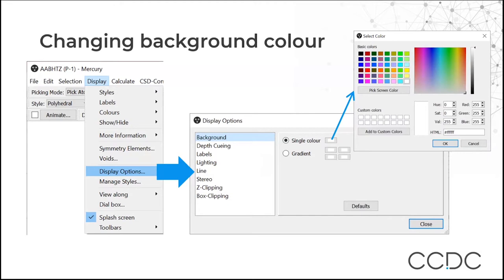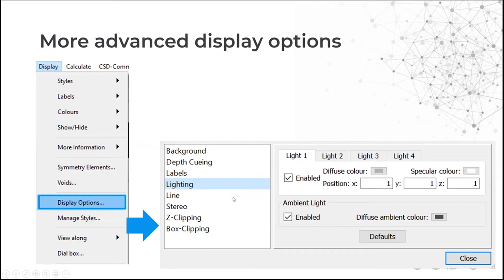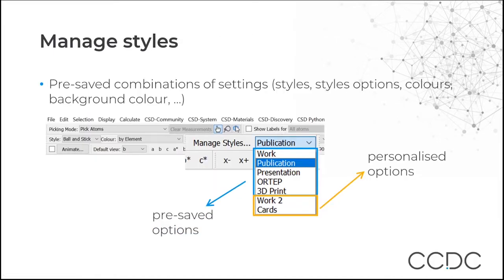As well as changing atom and element colors, you can change background colors. Go to Display and Display Options for various settings including background — you can choose a solid background color or different gradient types. Another interesting option is Lighting, where you can change where the lighting comes from. If you have a preferred style — such as a custom element color or background — you can save a pre-set combination of settings including styles, colors and background. Go to Manage Styles in the toolbar; there's a dropdown with existing presets, and you can create your own.